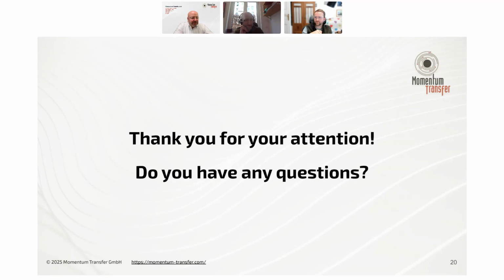And then Knut is asking, how should we reference the tool? Do you plan to have a publication or some document one could name in manuscripts? That is a really good point, and I have to say, I don't think we explicitly discussed it.